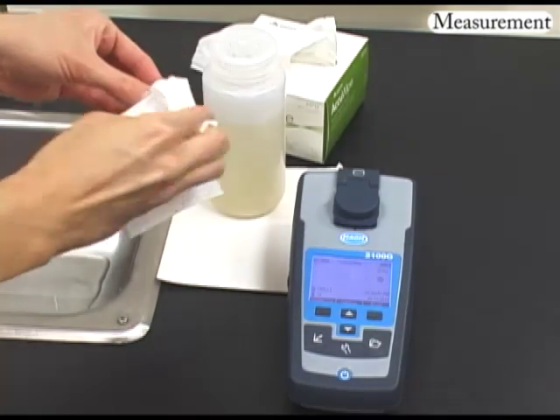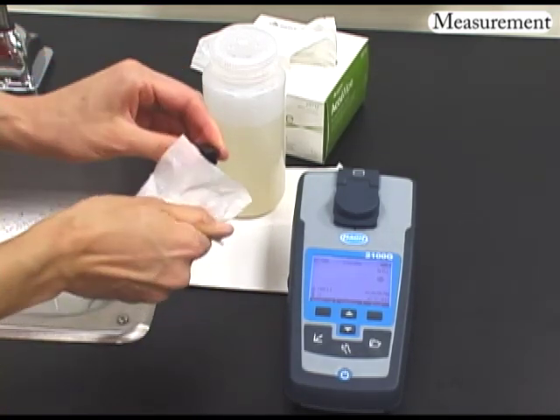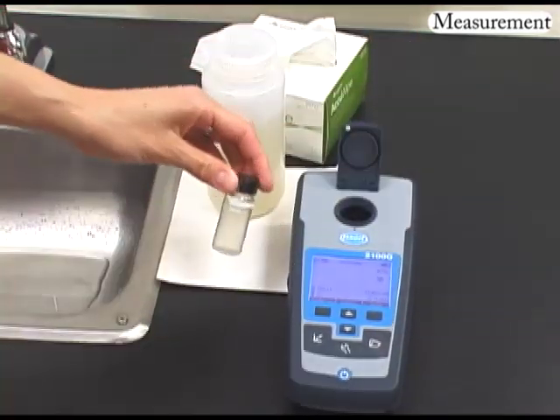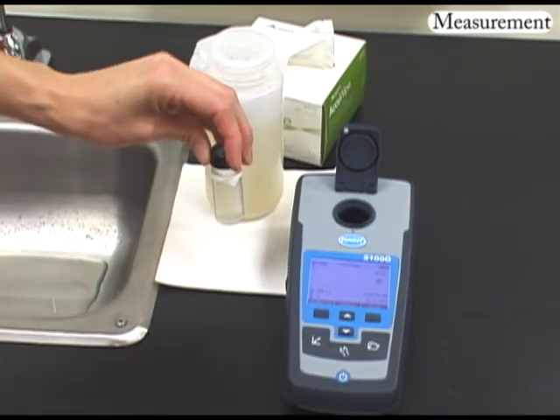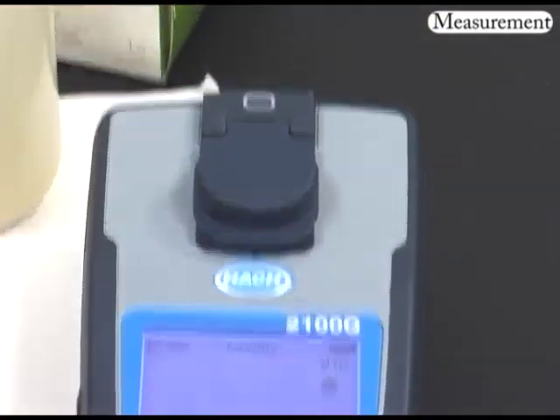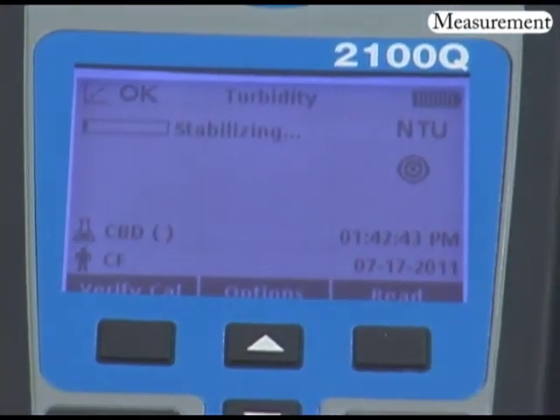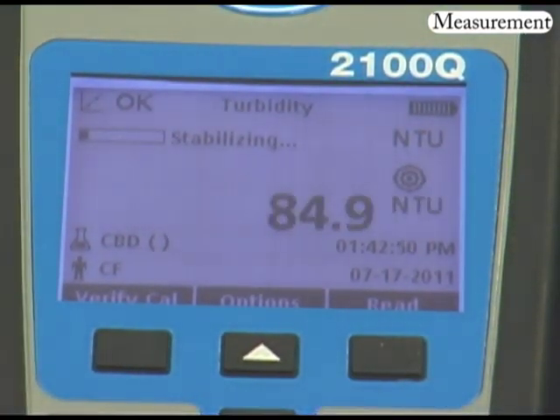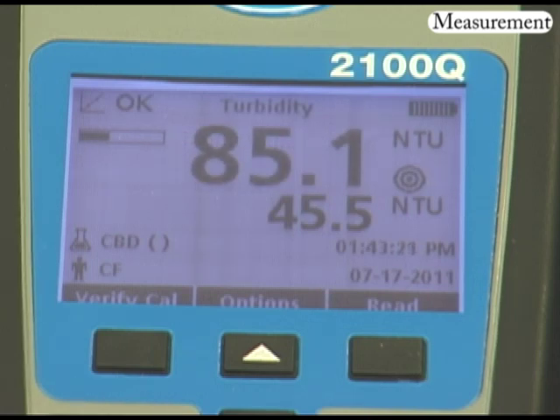Hold the sample cell by the cap and wipe clean with a lint-free cloth. Invert the sample cell a few times, insert it into the cell compartment, and immediately press the Read key. The 2100Q shows the calculated RST value while displaying intermediate results below.